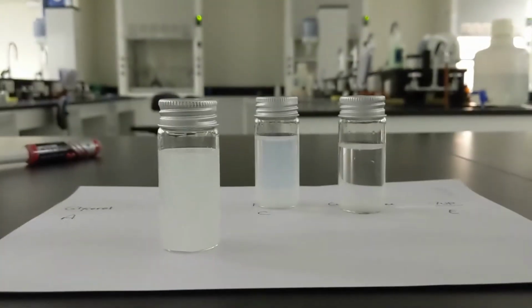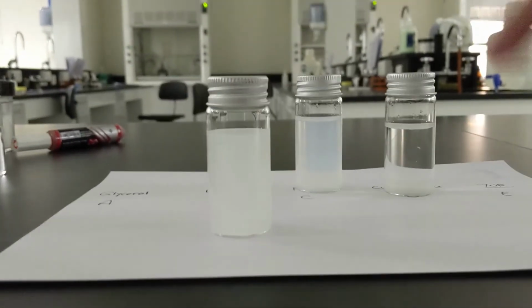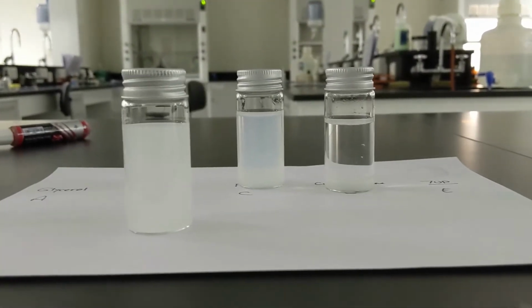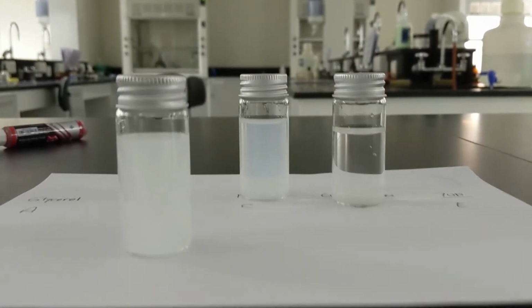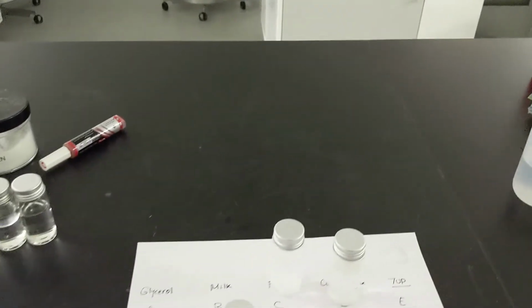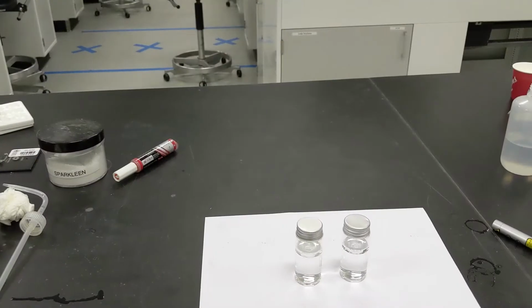So there might be a question in here about milk versus lead 2 chloride, which is a solid, which is a colloid and which is a suspension. Okay, I'm moving on to the next part here, so I'll be right back once I have it set up.